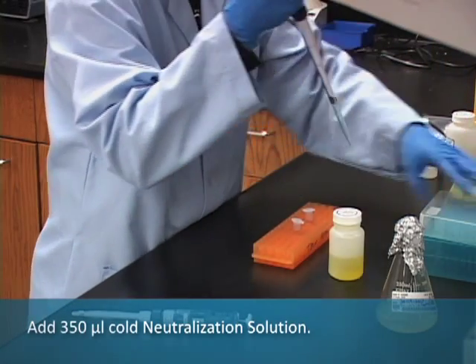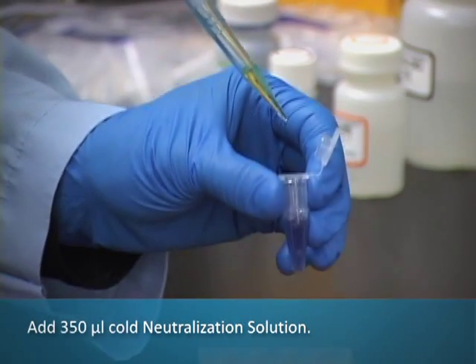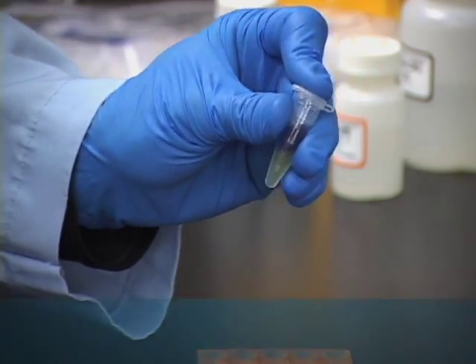Add 350 microliters of cold neutralization solution, and mix by inverting until the color changes completely from blue to yellow.